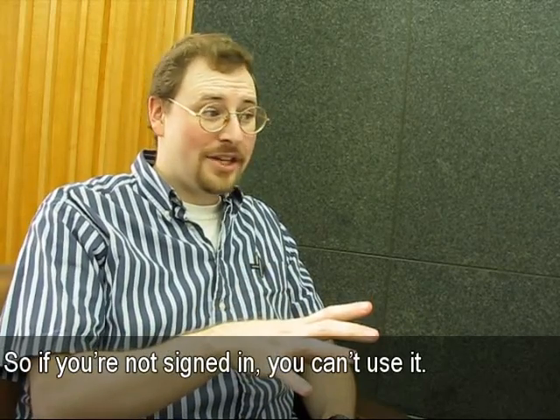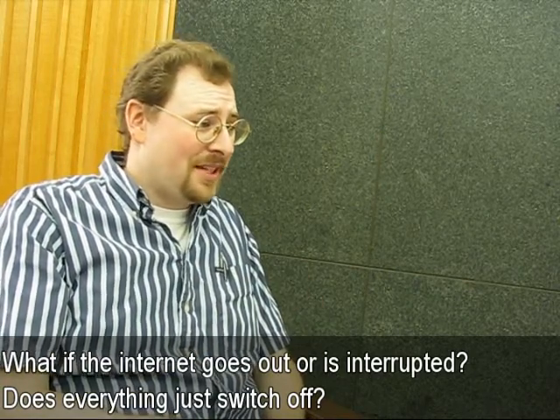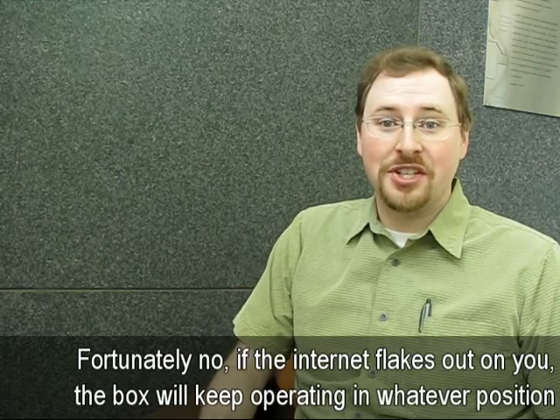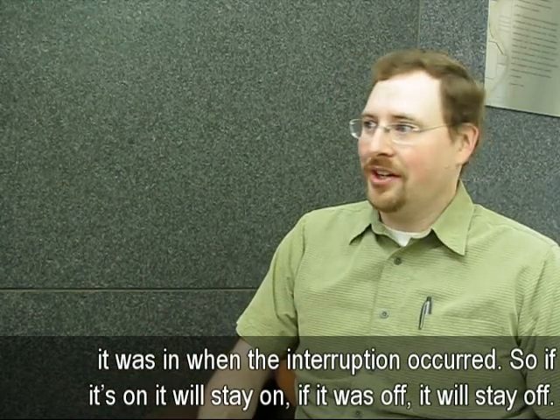So if you're not signed in, you can't use it. Exactly. But what if the internet goes out or is interrupted? Does everything just switch off? Fortunately, no. If the internet flakes out on you, the box will keep operating in whatever position it was in when the interruption occurred. So if it's on, it'll stay on. If it was off, it'll stay off.